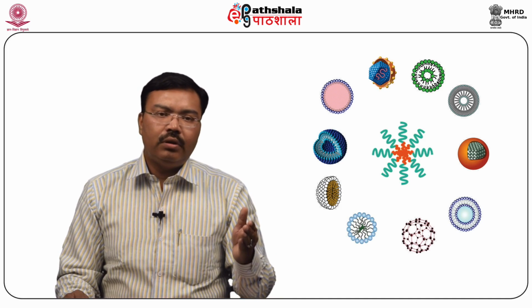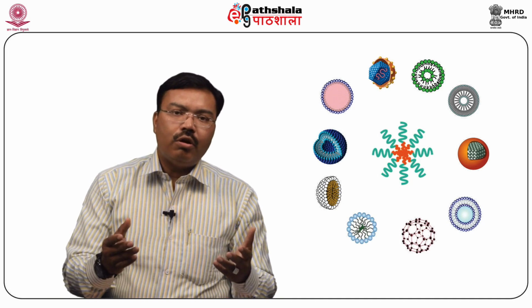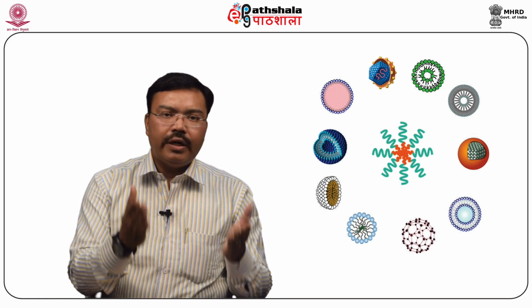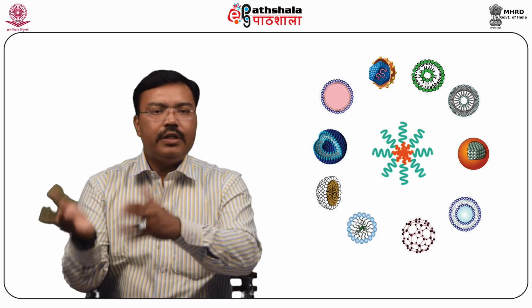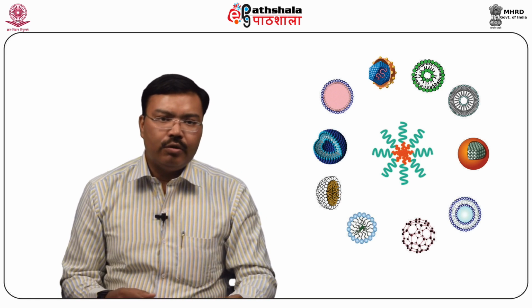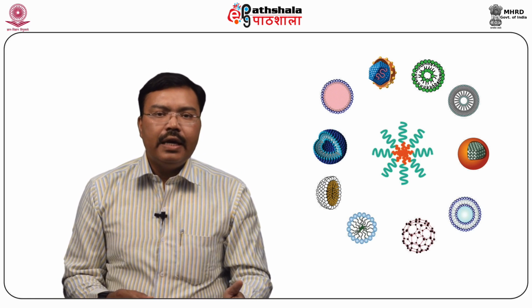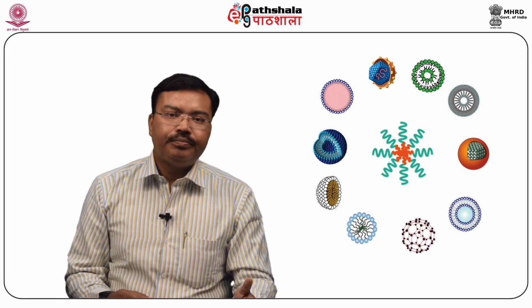In case of the heating cooling test, it is also called a freeze-thaw cycle. In this test, 6 heating cycles as well as 6 refrigeration cycles are given to a reconstituted microemulsion. The heating cycle may be at 45 degrees Celsius and the refrigerator cycle at 4 degrees Celsius.